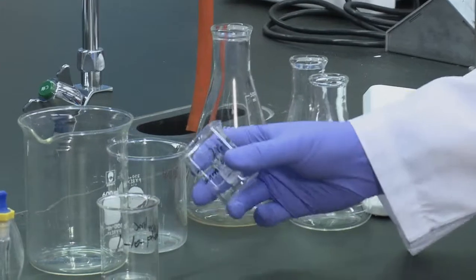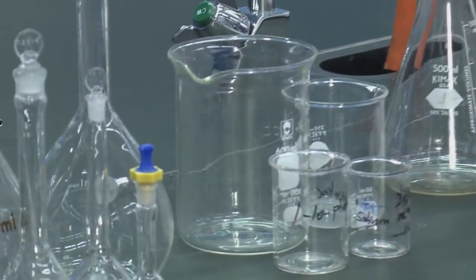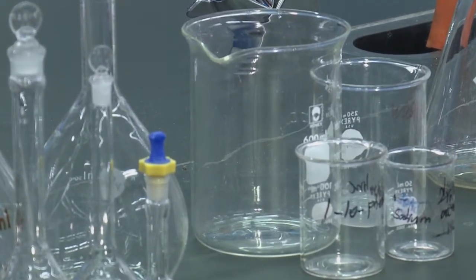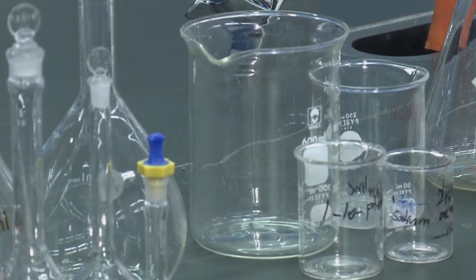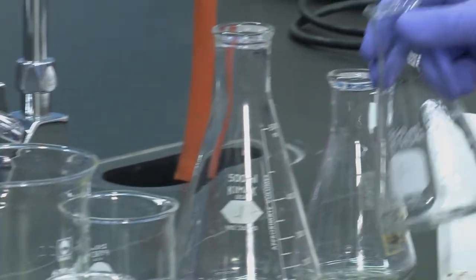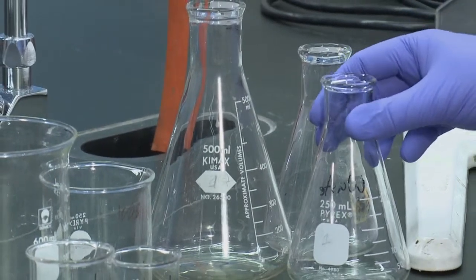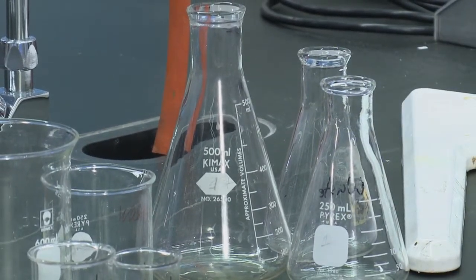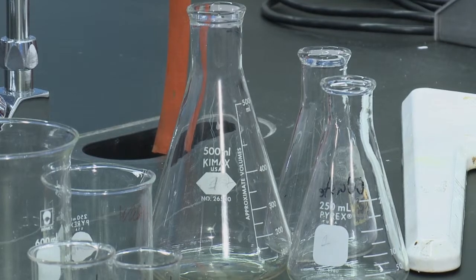The next glassware you'll use commonly are beakers. They are just for holding volumes of liquid but not for specific accurate measurements. Likewise with Erlenmeyer flasks, which are often used for titrations, they are not to be used for accurate measurements of volume.